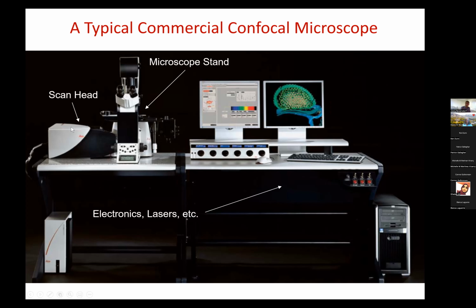The confocal microscope is a digital microscope, so it will be run with a computer, and the images will be displayed on the computer screen. And then you have all kinds of external electronics, which doesn't fit into the scan head, where the lasers sit, some power supplies, additional computers, all that. And that's usually hidden away in some additional box sitting next to your microscope.